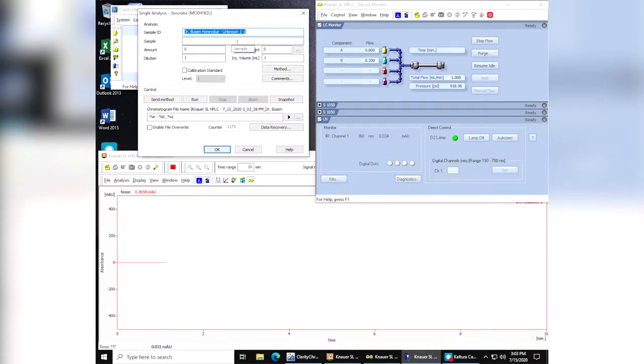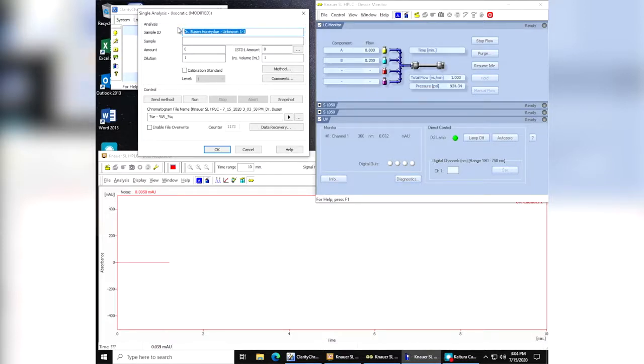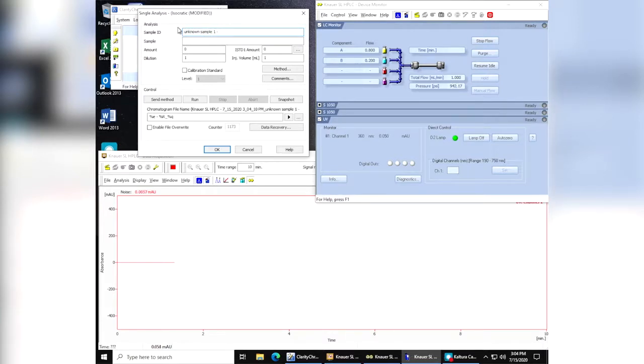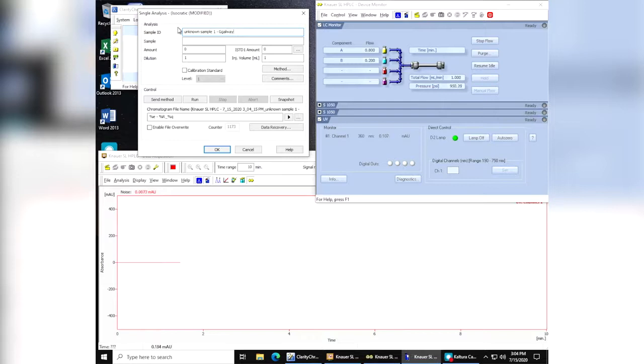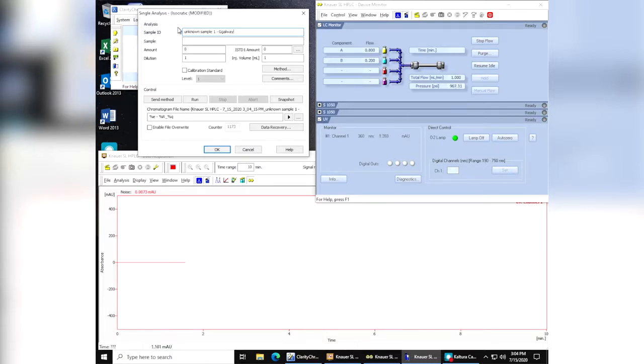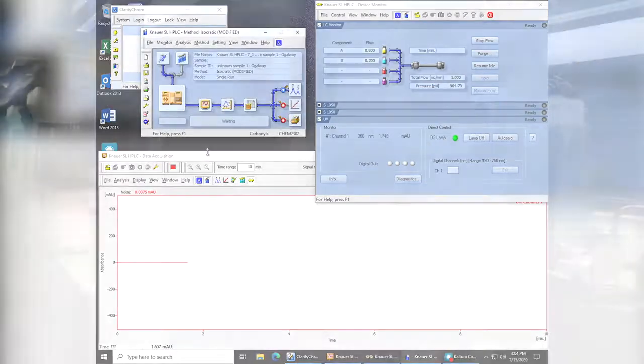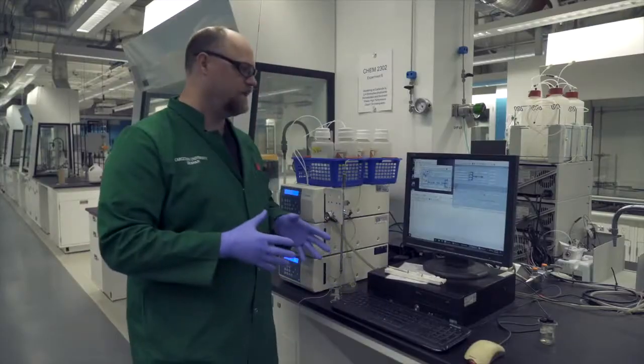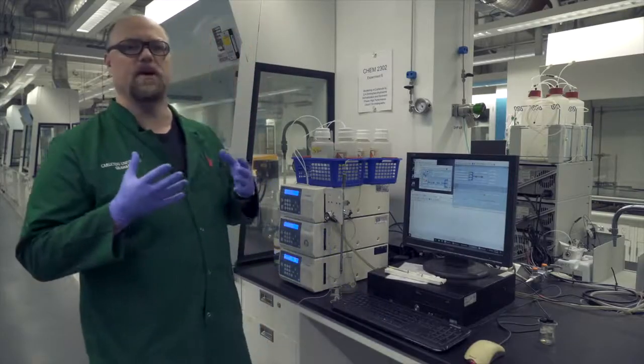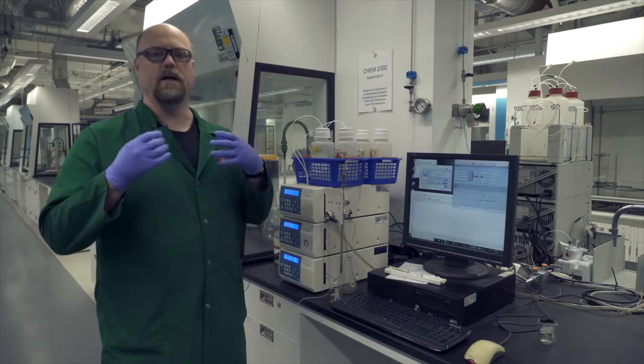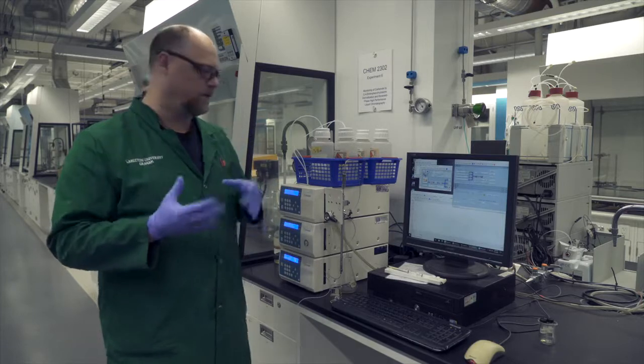We're going to change this name here to unknown sample one. And then it's a good idea to put your name with it, just so that it's easier for you to find your file amongst a whole bunch of different files, because they could all be labeled unknown one. But if you put your name on it, it's a lot simpler to find. Once you've got that done, you click OK. At this point in time, the instrument is now ready in order to do an injection.